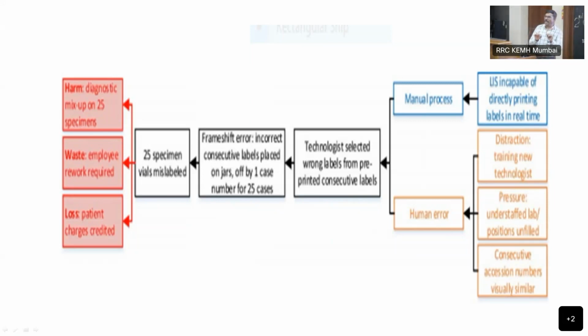That is, once an entry is made in the LIS, it asks for printing of the barcode, so immediately that barcode can be assigned to that lab ID for that person, correct? That facility was not available. So she had to print all the barcodes and label them individually, correct? And another thing was that the pre-barcoding she did had barcode smudging. There was a barcode issue.